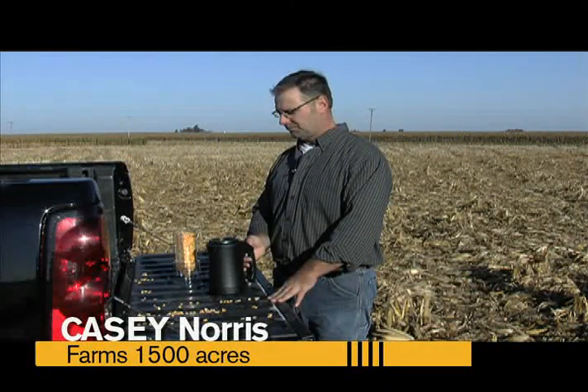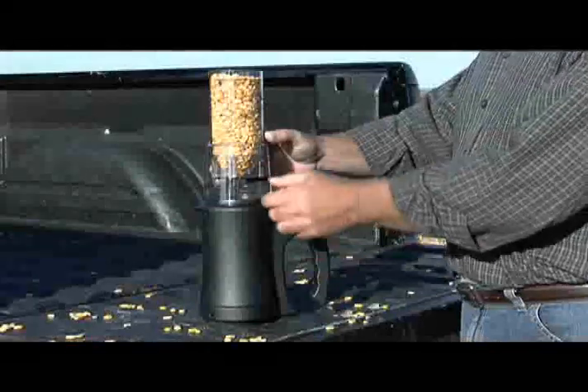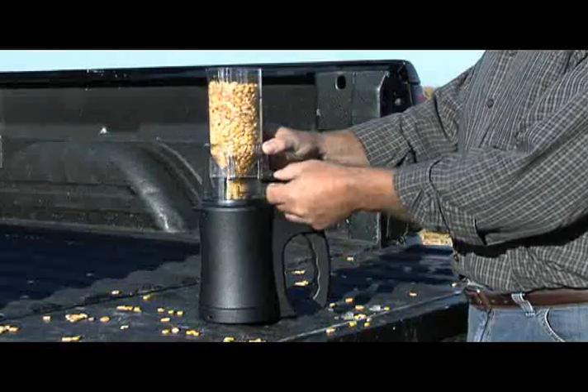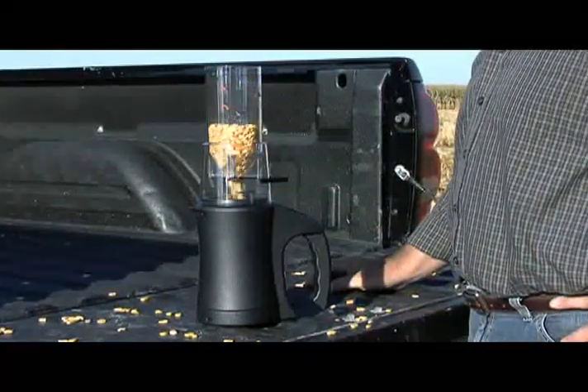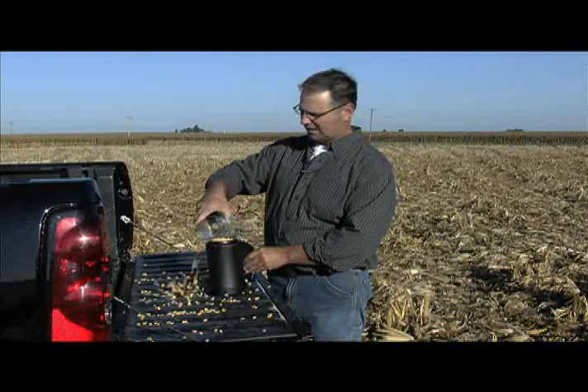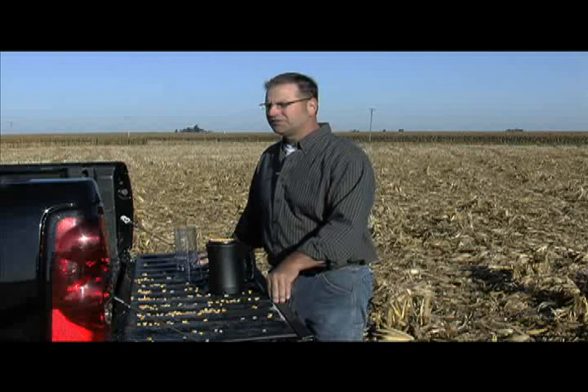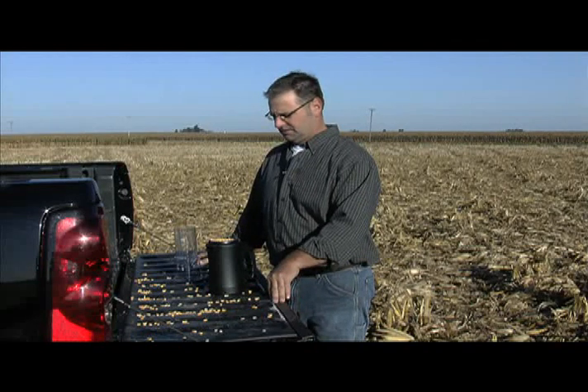I pulled a sample of corn. All I have to do is press it to test it. I filled my loader up all the way and set it on top of the tester. Pull the slide — it fills the cell up. I take the loader and I strike it because we want the corn level. And I push to test. In just a few seconds, we'll have our answer. And there we go — it's 14.9 with a test weight of 60.5. It's that simple.